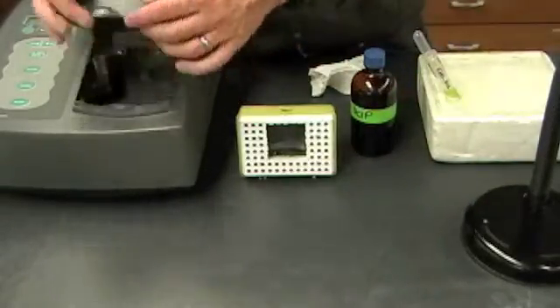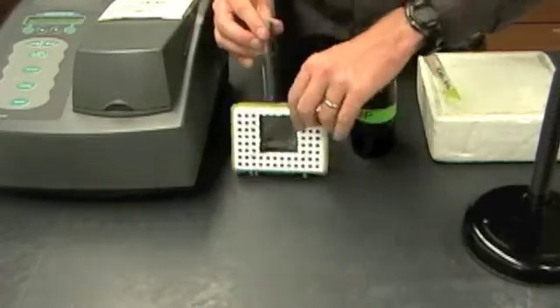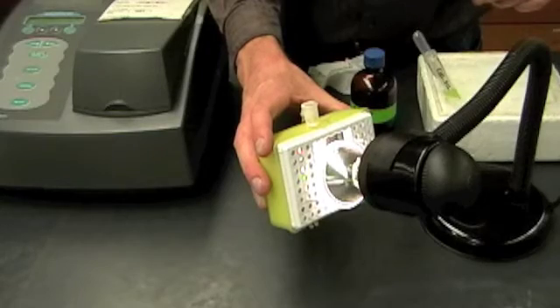Now once that's been done, I'm going to take it off, cover it over, put it in the cassette, and then hold it right up against the light. And now I'm going to wait for one minute.